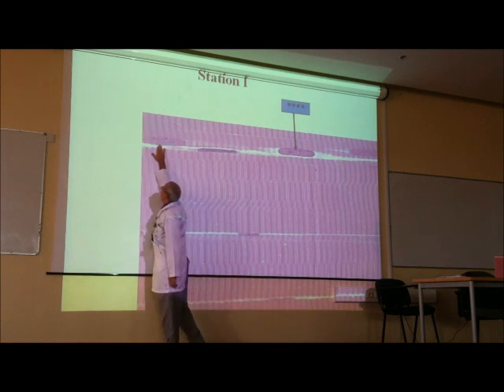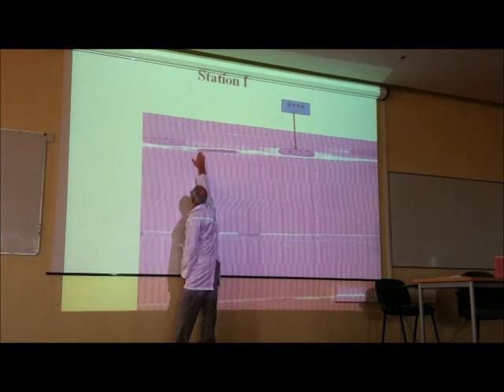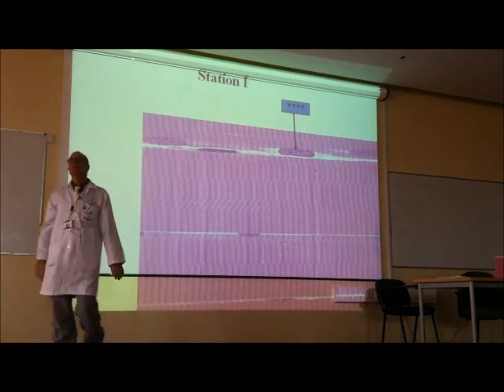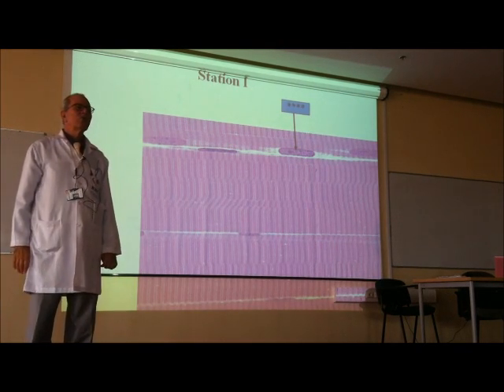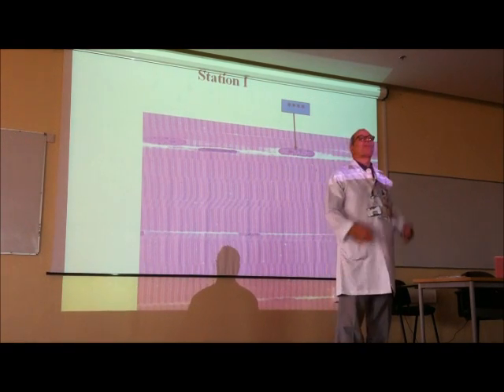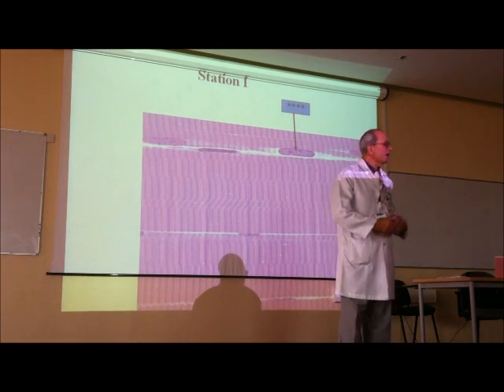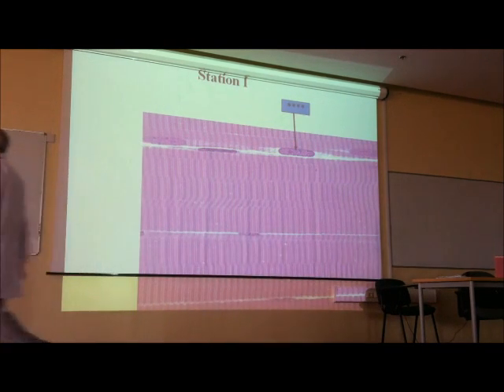These are larger and paler. These are darker. What is the type of nucleus? What is this nucleus related to, what is present in between the muscle fibers? Connective tissue. What is the commonest type of connective tissue cells? Fibroblasts, together with macrophages. Then the other types of cells present in connective tissue.